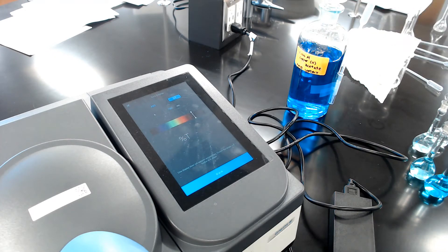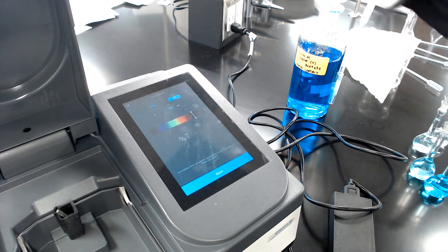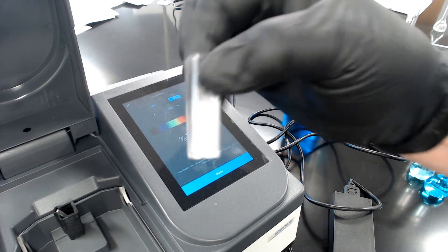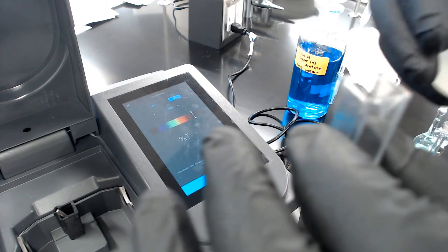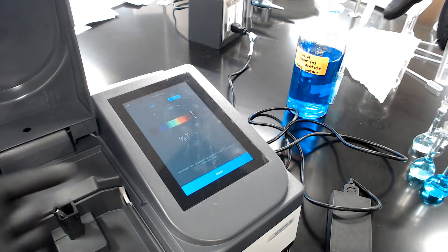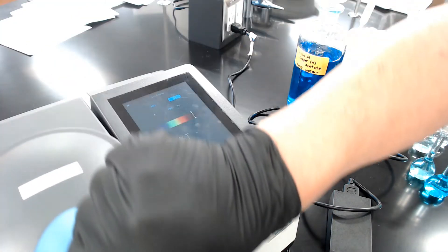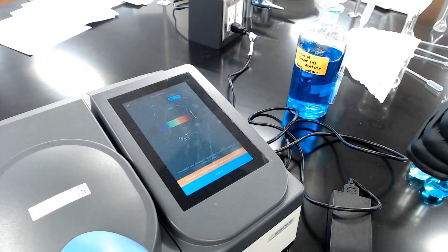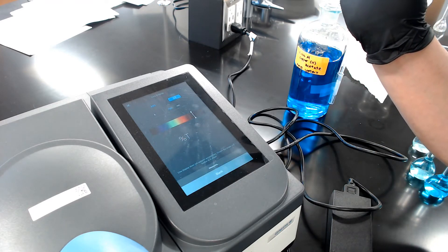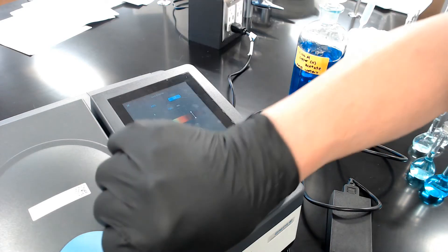Next, open the instrument and do a background blank. The cuvette is the plastic piece — hold it by the ribbed ends; do not touch the transparent sides. Use the squirt bottle to put water into the cuvette. The light travels in one direction, so orient the ribbed side facing the correct position, stick it in, close the door so no outside light enters, and push 'Blank.' This sets 100% transmittance as your background.